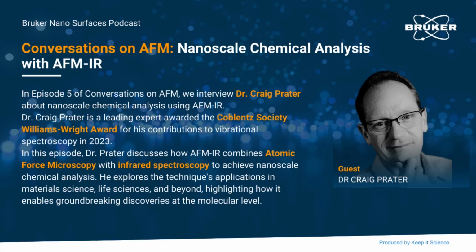I'm Dr. Elizabeth Kugler, a science communicator and your host of today's conversation, Nanoscale Chemical Analysis with AFM-IR. Today we are focusing on AFM-IR, which is a technique that integrates atomic force microscopy with infrared spectroscopy to deliver nanoscale chemical analysis. This powerful approach drives breakthroughs in material sciences, life sciences, and beyond.